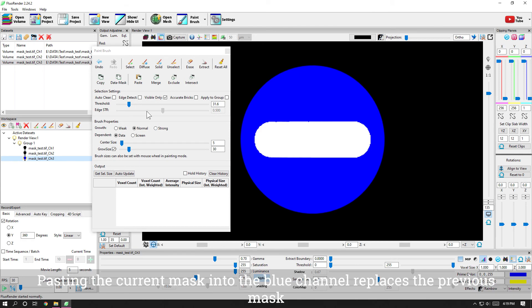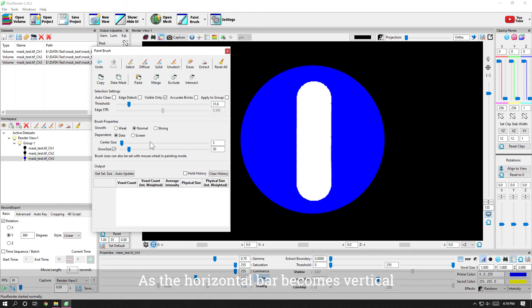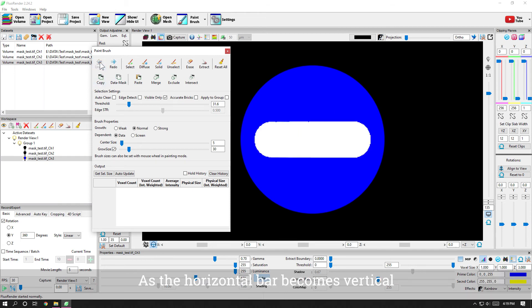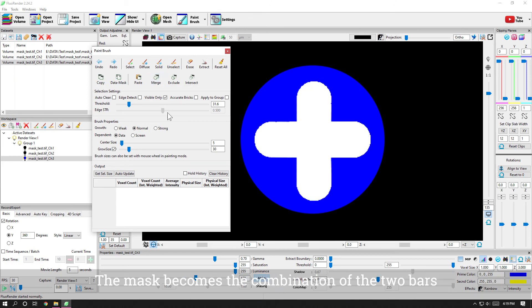Pasting the current mask into the blue channel replaces the previous mask, as the horizontal bar becomes vertical. Undo the mask and click merge instead. The mask becomes the combination of the two bars.